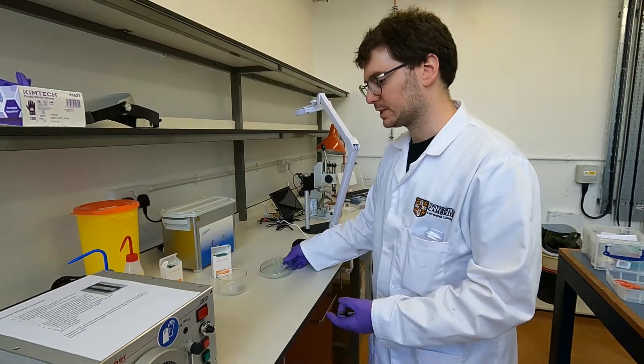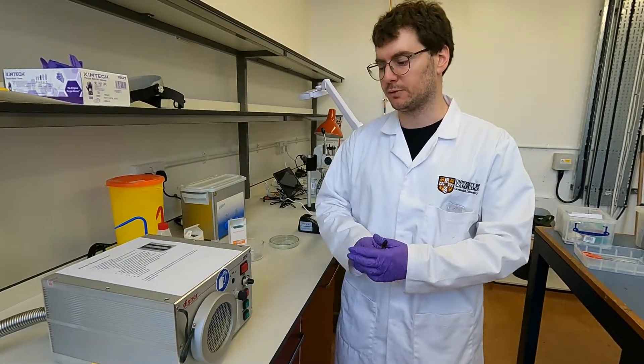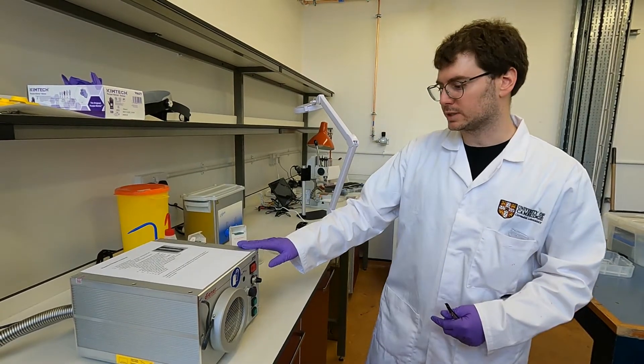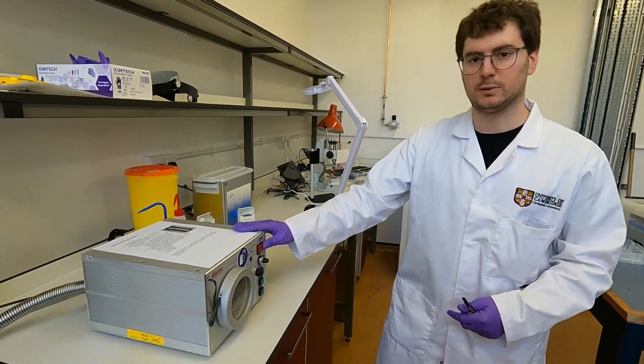We come to the last step which is the bonding step. For that we're going to use this plasma etcher here. It's a small unit and the first thing we need to do is to turn it on.